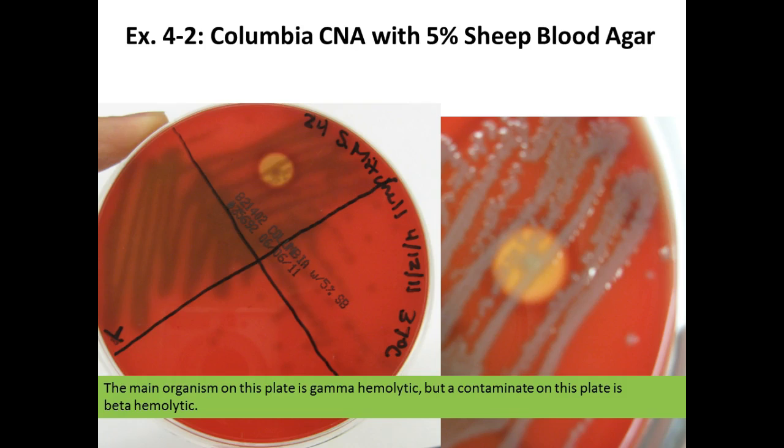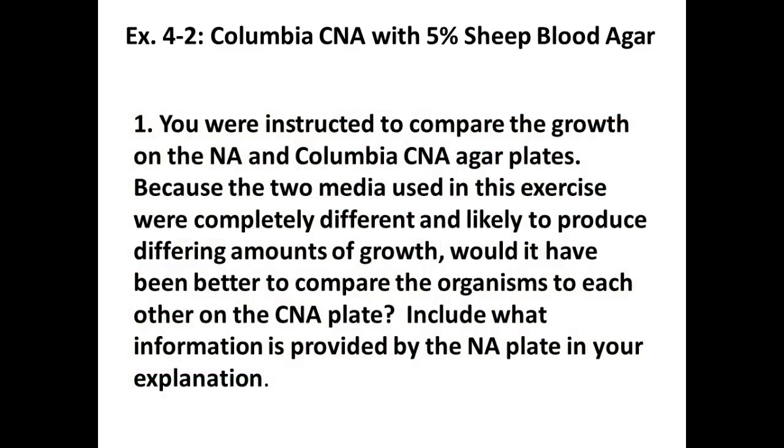Staphylococcus aureus, a lot of people have in their noses. And so breathing on the plate could have deposited a few of those organisms and caused them to grow. And then on this plate, you can see the beta hemolysis. So yeah, if the whole plate was like that, then that would have been her organism, right? But that's clearly a contaminant. An interesting contaminant at that, though, right? Good teaching moment. So why would we do nutrient agar plates?